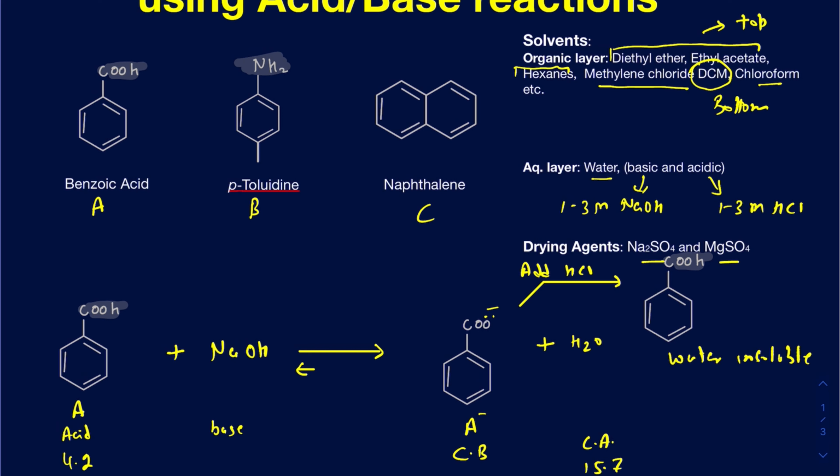or maybe different grams of each mixed up, and they would be given to you, and you want to first go ahead and dissolve that in an organic solvent. And like I said here, I used methylene chloride, and I'm going to assume they would dissolve. All three would dissolve in methylene chloride. And obviously you do want to test whether they would dissolve in a given choice of solvent. But for right now, I'm going to assume they all do dissolve in dichloromethane.